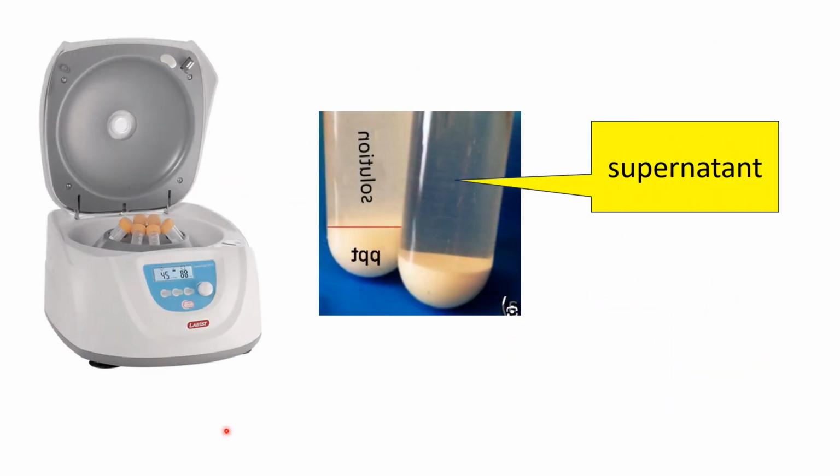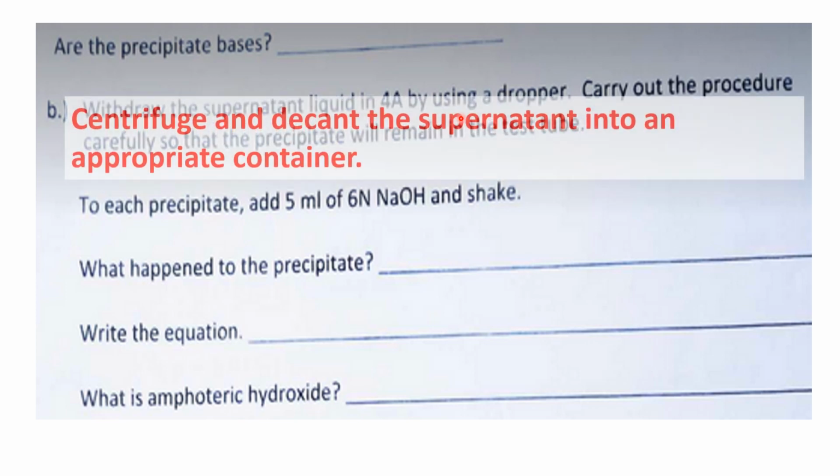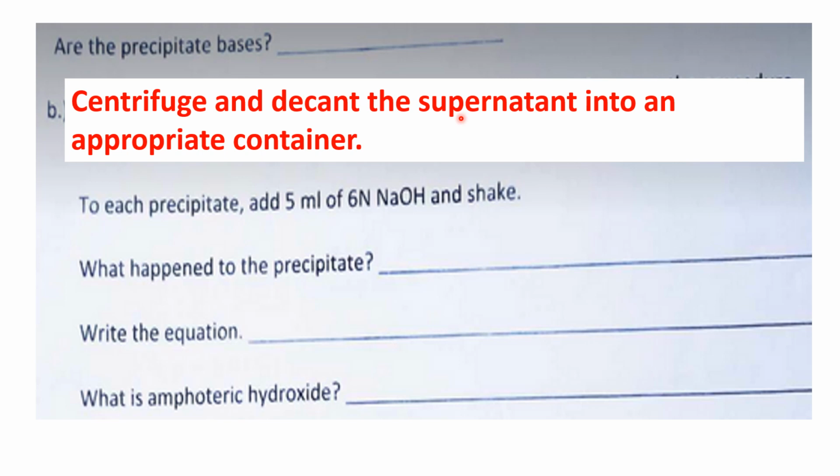This is the instrument that I'd like to introduce to facilitate separation of the supernatant from the precipitate. This is called the centrifuge. Okay, so instead of this portion, withdrawing the supernatant liquid by using a dropper, we do not do this anymore. Instead, we make use of the centrifuge. Centrifuge and decant the supernatant into an appropriate container. To each precipitate left in the test tube, add 5 ml of 6 normal sodium hydroxide and shake.